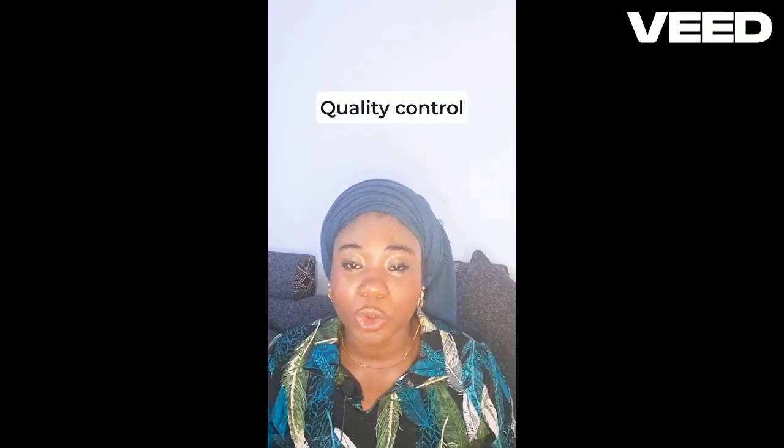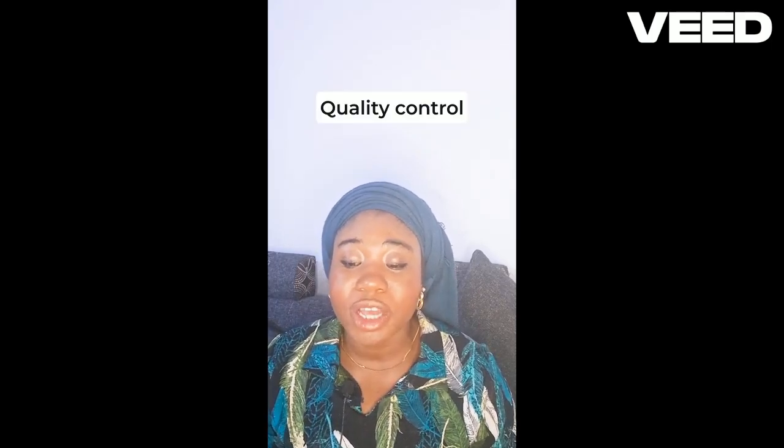Also, another characteristic of good laboratory practices is quality control. Quality control requires establishing a quality assurance mechanism to monitor and ensure the reliability of test results, including equipment calibration, personnel training, and quality control procedures.